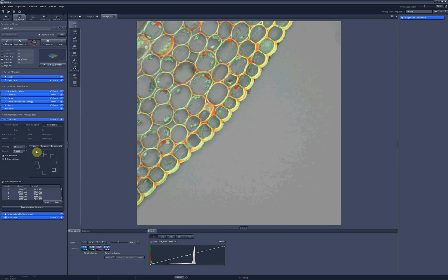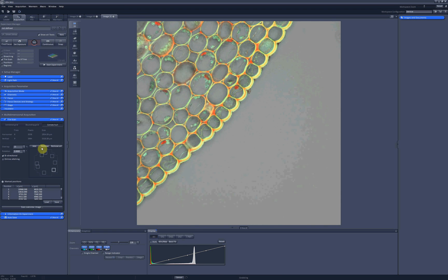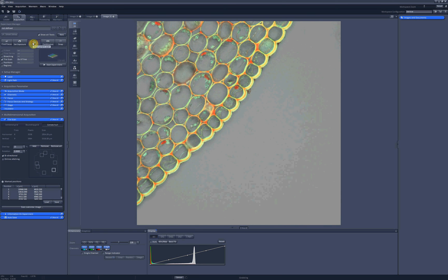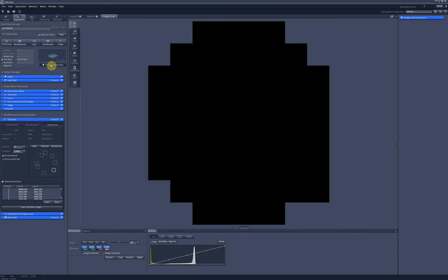And I think I have covered my sample quite well, and if I click on start experiment we will see the result.